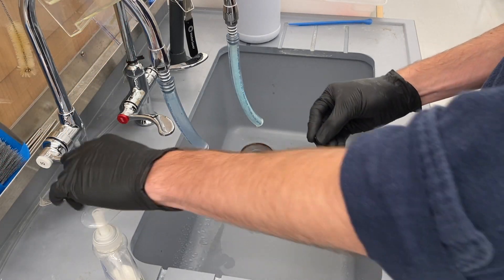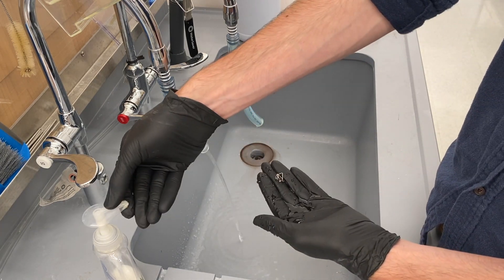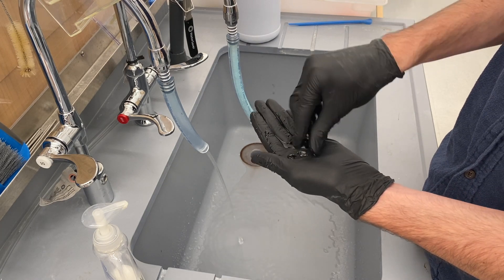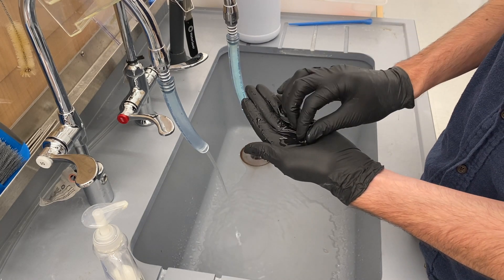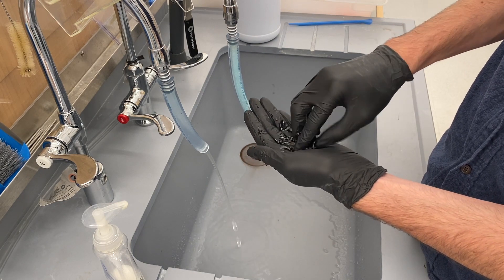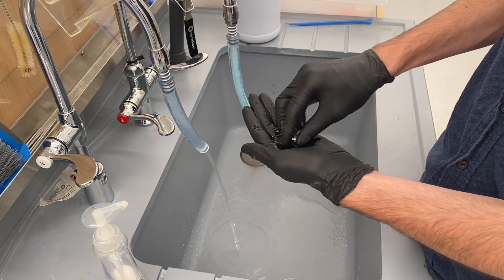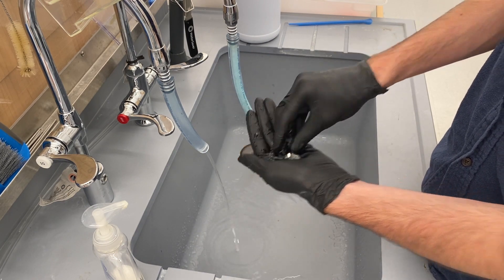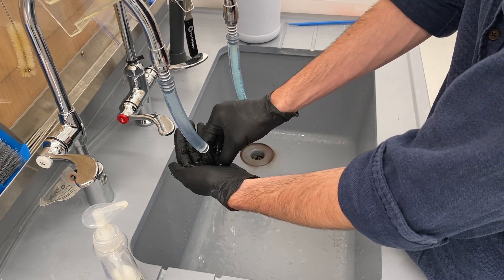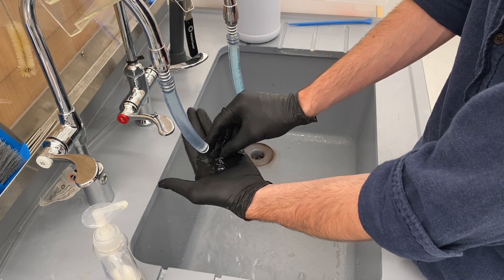When these tags come from the manufacturer, they often have residual oils from the production of the tags. For that reason, I make sure to wash the tags in order to prevent any potential issues with the mice. Historically, there have been ear infections caused by unclean tags. I rinse them with soap, as you can see. It is important to make sure that they are thoroughly washed and rinsed in order to ensure that there is no residual oil that could cause ear infections in these mice.